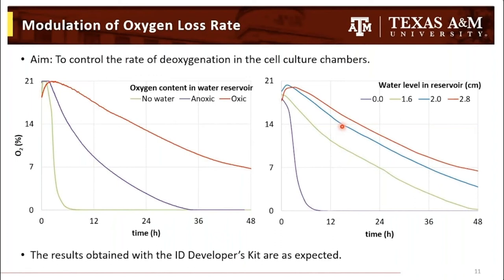What's very valuable about these results and the results that I have shown before is that all of them agree well with the phenomenology of oxygen transfer in microfluidic systems. They agree well with our hypothesis as to how the oxygen permeability of PDMS will affect its behavior in the chip. And so the results obtained with the ID developer's kit are basically as expected for our experiments.